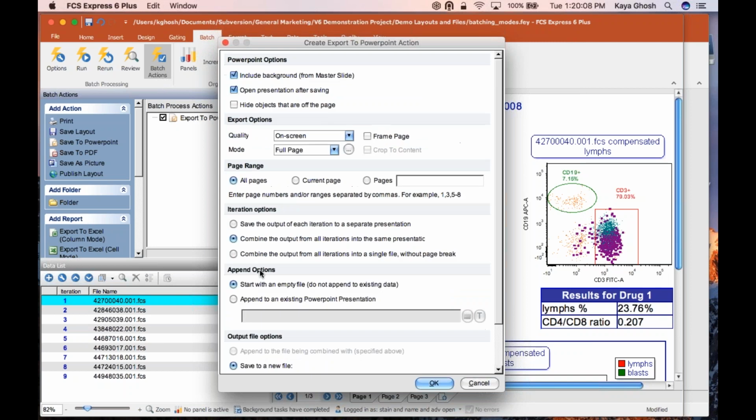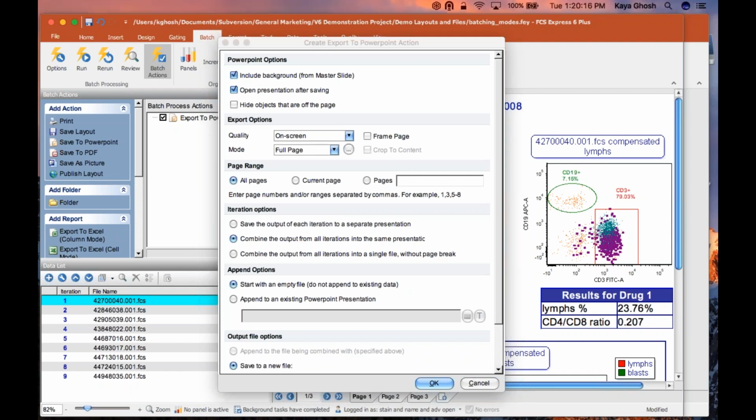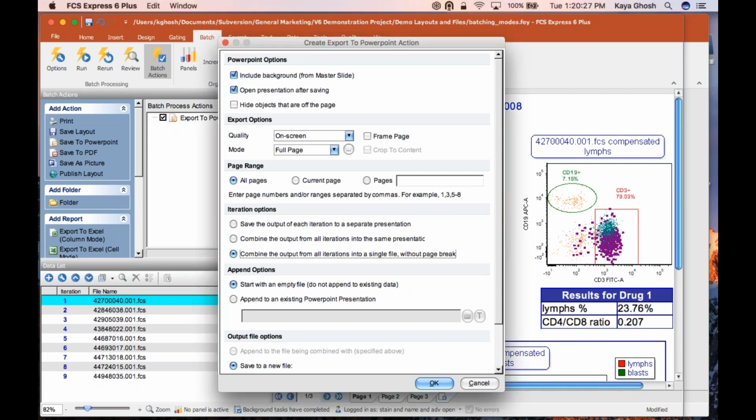So again, when we're doing these custom grids or preset modes, you always want to select this last option right here. And I'm so sorry, but my drawing tools are not working. So, oh, they're working occasionally. So you always want to select this option when you are doing the custom grids or the preset modes. So we are going to just do the current page, which is page 1 right now. So let's say that's the page we're interested in.